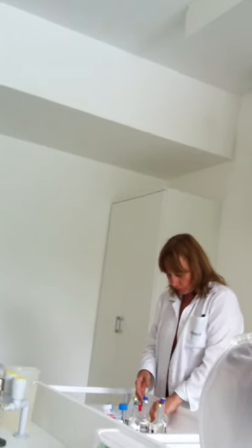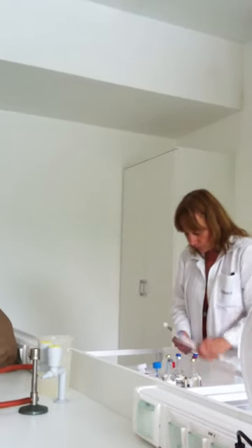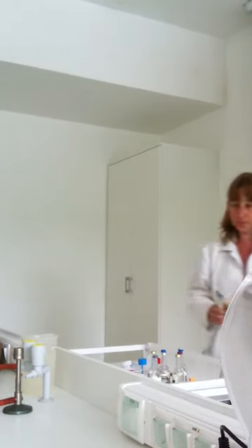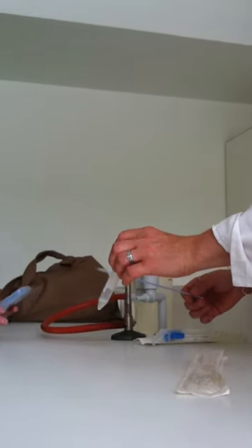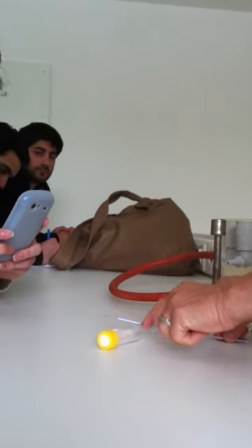What else? We have this one, which is important, and this one. For this, yes, okay. First of all, this is a cyto brush. Together with this special container, this is a homemade container in the micro. This is important.